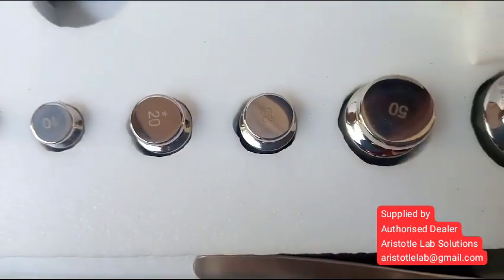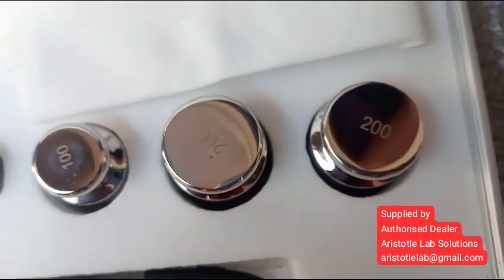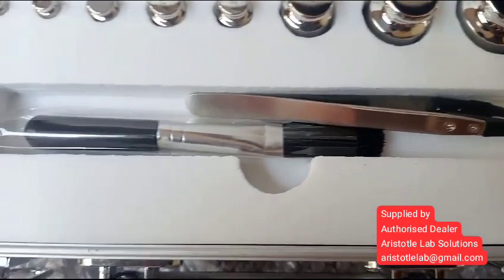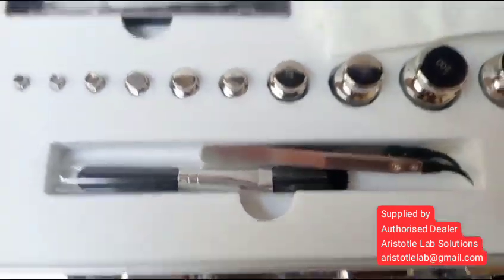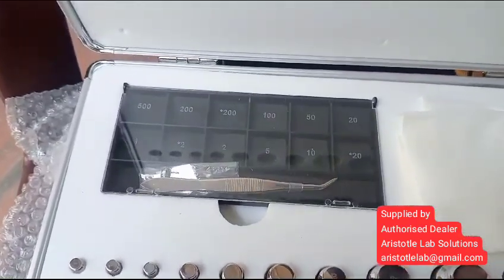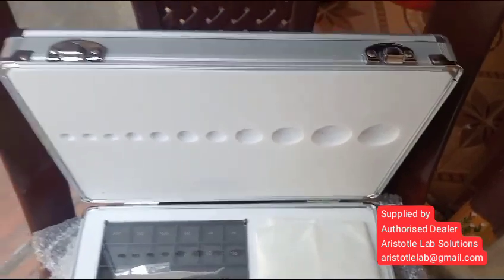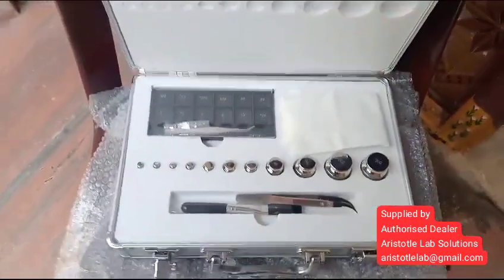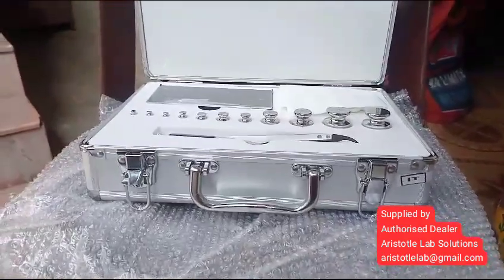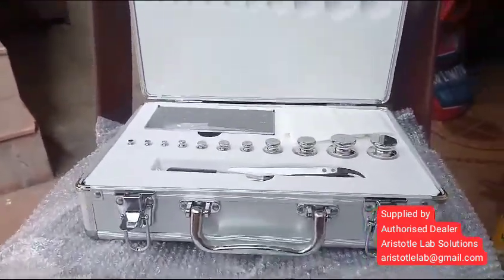1mg to 200 grams. Supplied by Aristatil Lab Solutions. Also available: 3mg to 300 grams in F1 class.